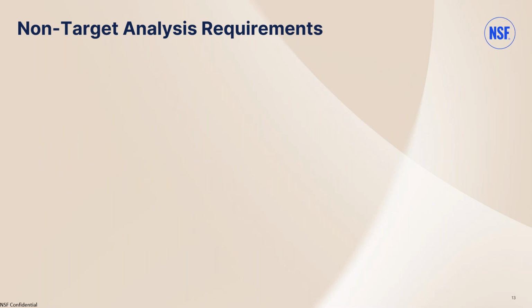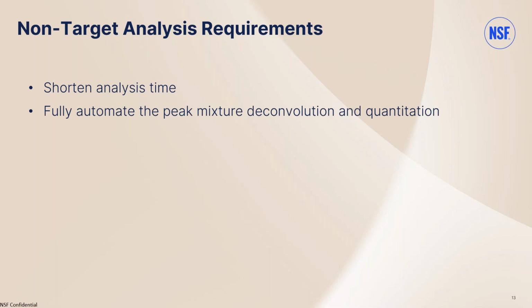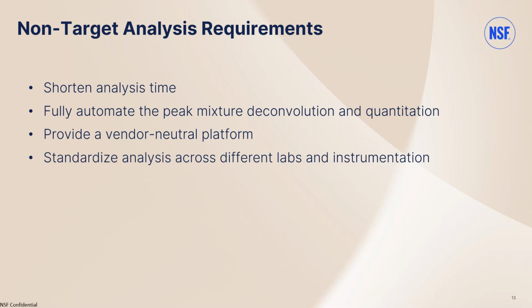So when we were looking for a solution for this, we had some goals in mind. Primarily, we wanted to shorten the analysis turnaround time. But we also wanted to automate as many of the tasks involved as possible so that the analysts could spend more time making determinations and less time making manual tasks just to get the data to a format that could be evaluated. Again, we needed a vendor neutral format.